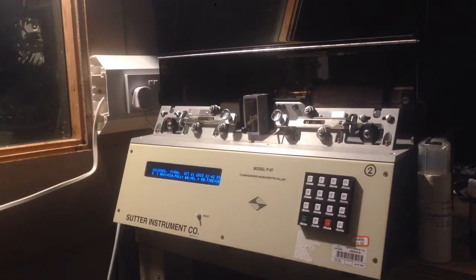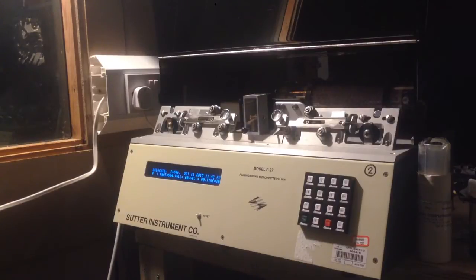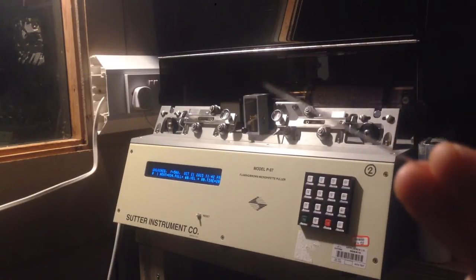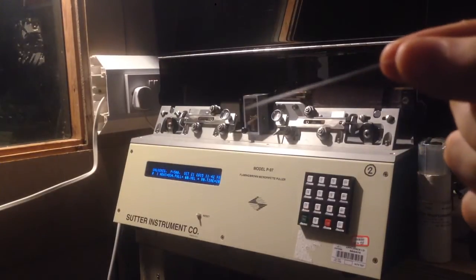Today I decided to start playing with a pipette puller which I picked up at an auction a while ago. Pipette pullers are instruments used for creating micropipettes, which are basically very small pipettes — very small tubes which come to a very fine point.